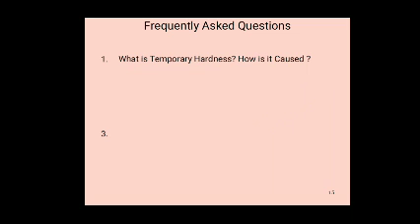Calcium bicarbonate formula Ca(HCO3) taken twice. Magnesium bicarbonate formula Mg(HCO3) taken twice. Calcium bicarbonate gram molecular weight 162. Magnesium bicarbonate gram molecular weight 146.